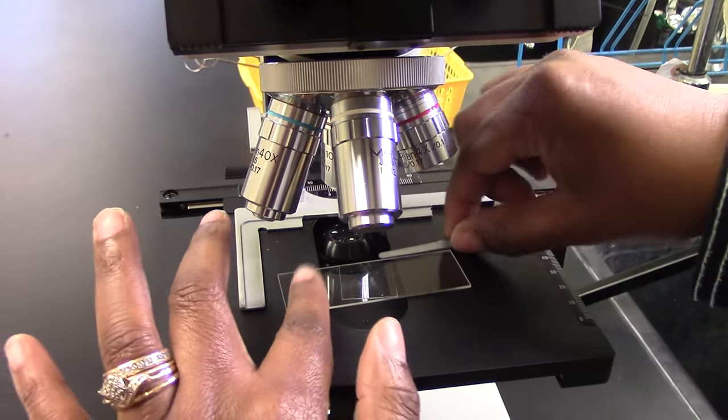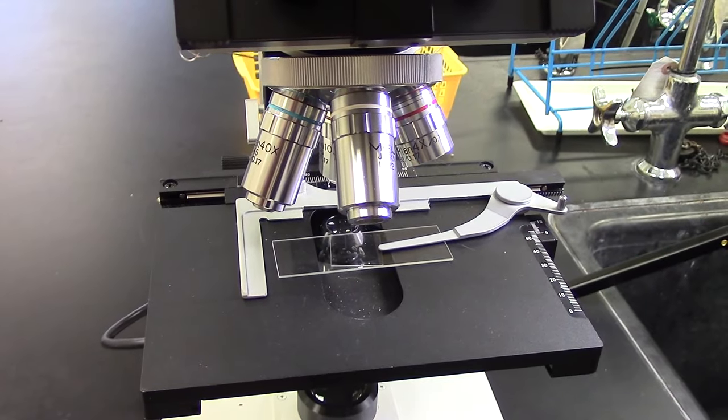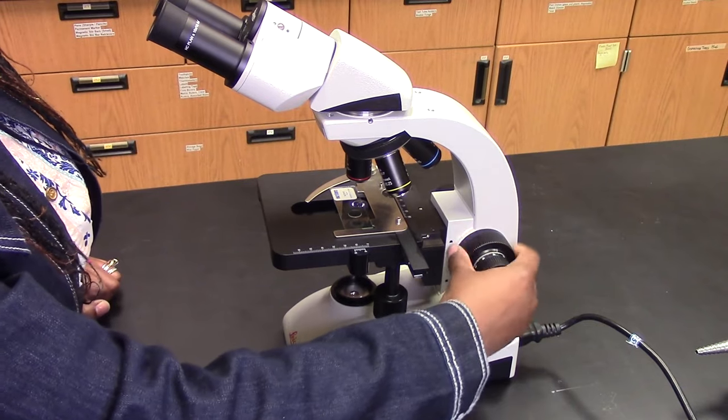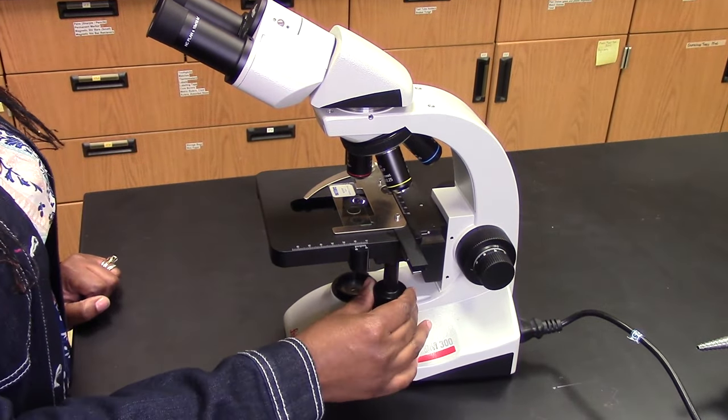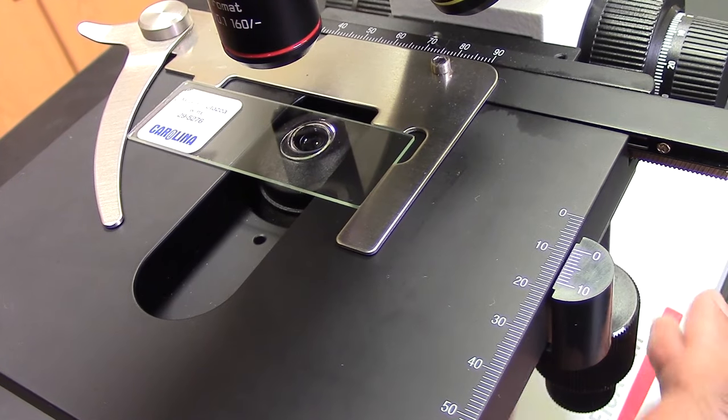Don't try to make a swinging stage clip fit on top of the slide, or it can break the slide or clip. Once you have the slide on the stage, use the coarse focus knob to lower the stage all the way to the bottom, and use the stage control knobs to move your sample so that it's directly over the condenser.